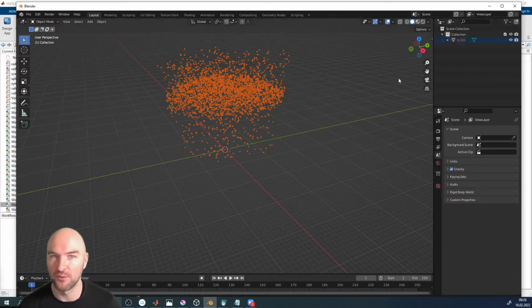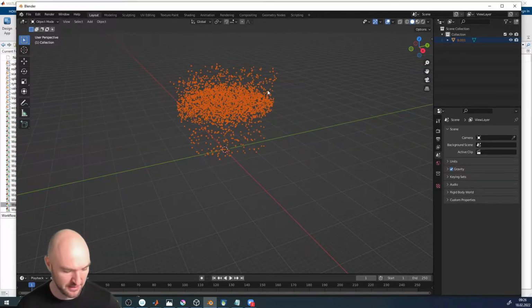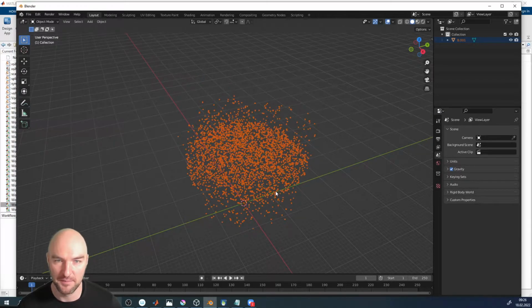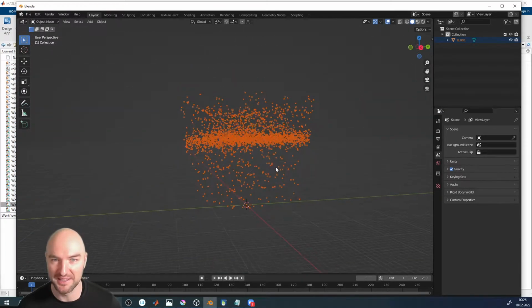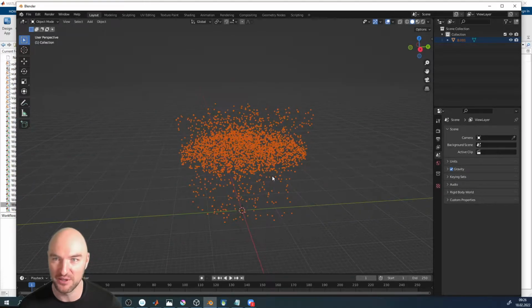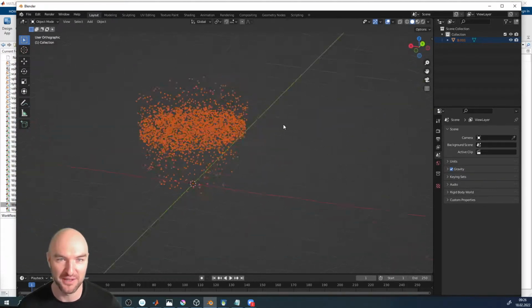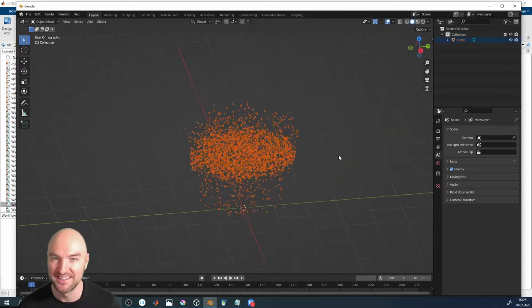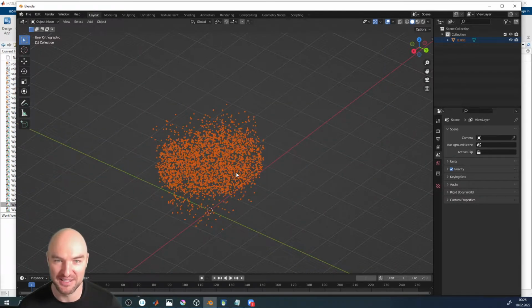And now we've got our Boron object here, and you can see we can work with that. By the way, you can do whatever you want. You can delete vertices, you can fudge your atom probe data any way you want. Obviously, you're not supposed to do that, so don't fudge your data. And if you do, don't tell anyone I told you how to do that. But anyway, you can do anything you want with your data.